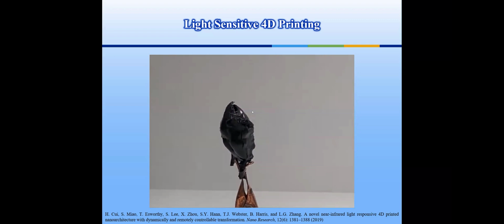More importantly, we want to use that for applications. So that's very important. I heard from Martin's excellent presentation about the potential application related to the cardiac tissue patch, so I'm going to mention some brief information in my talk also. One application people are thinking about for biomedical use is minimally invasive surgery. You can print a bigger structure and compress it into a tiny structure, which can either be injected or easily implanted into the human body, and then it can pop up inside the human body.